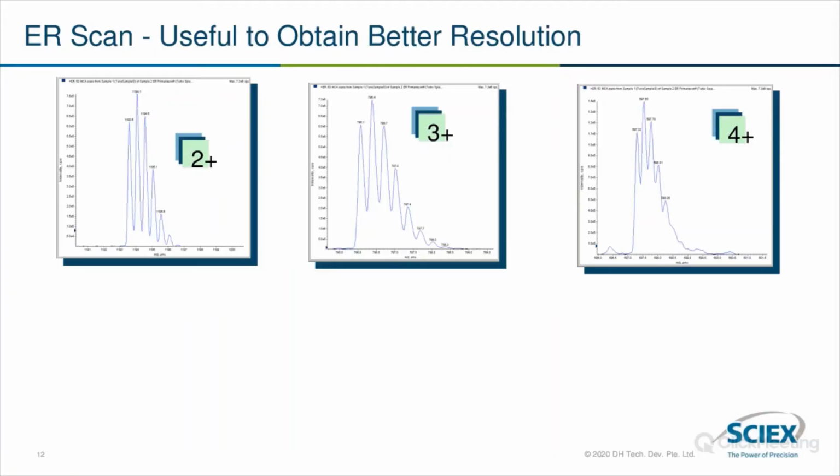And not only with small molecules, even if you are running a small protein or peptide, doubly, triply, and quadruply charged ions can also be resolved in a very appropriate manner using Q-trap technology. And this is what the scans and isotopic resolution you are seeing on this current slide.